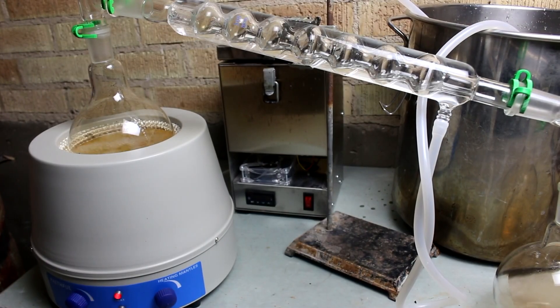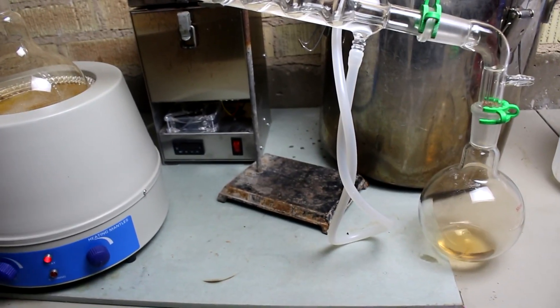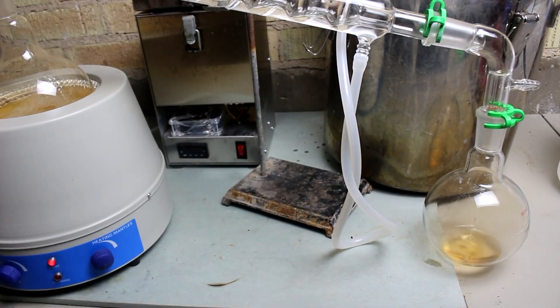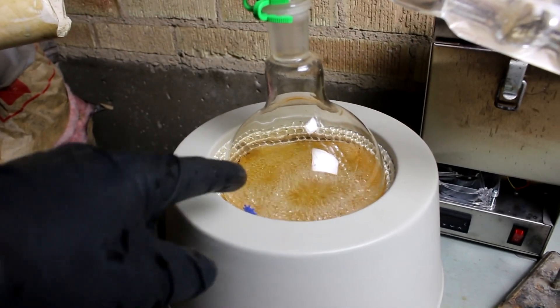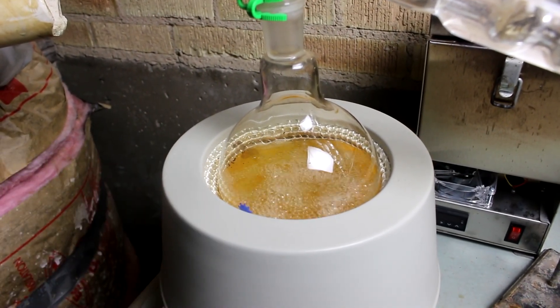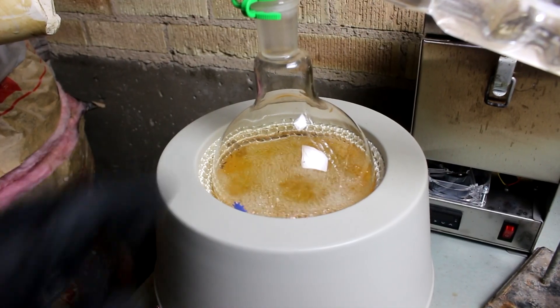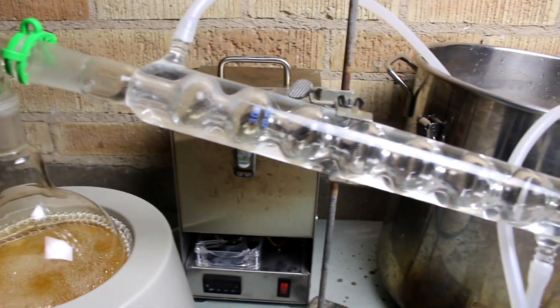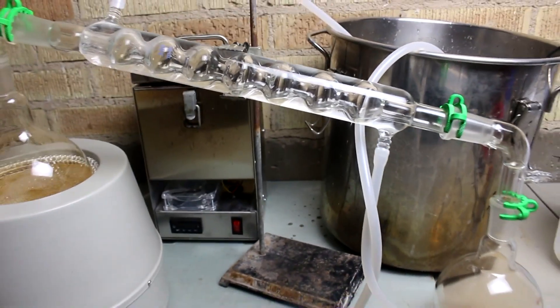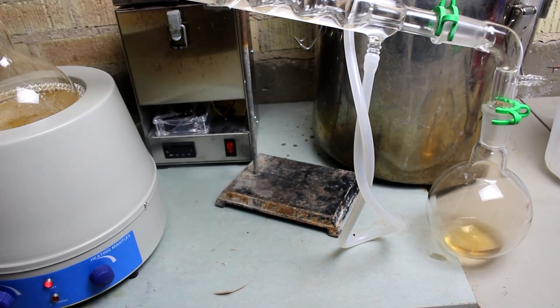Looks like it needs another shot of acid. I'm running a bit low on nitric acid so I decided to make some more. You can see I've got some nitric acid dripping down into that flask. Over here I have a solution containing potassium nitrate and sulfuric acid, and the nitric acid is boiling out, just condensing on this condenser here. This is how I've been making most of my acid recently.